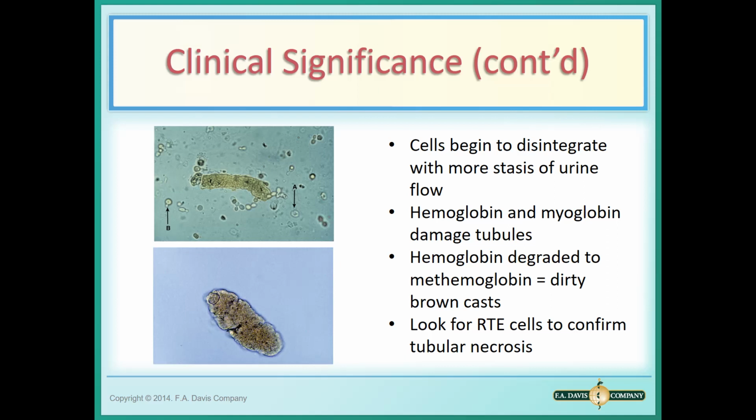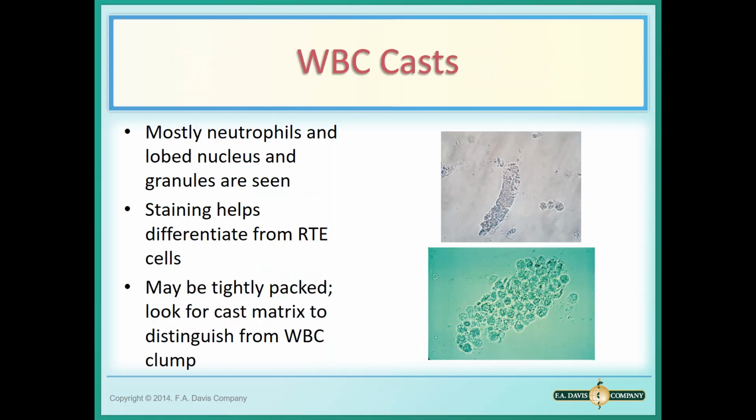The other thing I wanted to point out, that the slide did really well, here's a red cell cast. There's a red blood cell, but we have all this yeast here too. Do you see the little bud off the yeast? These are budding yeast here. That's a red blood cell. So you have to be careful and look and see what you see.